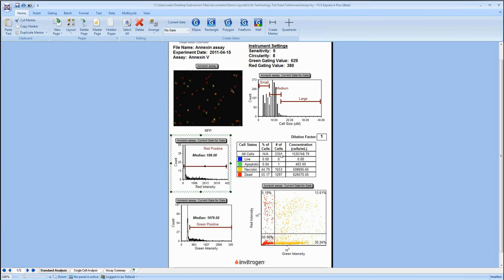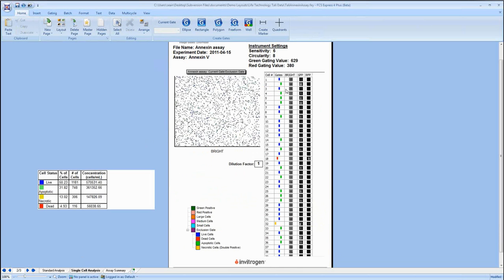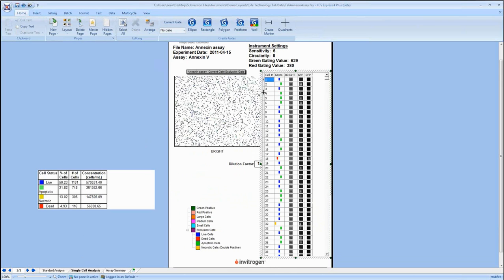And all of the statistics, including cell concentrations, are going to be updating with this. So it's a way that we can start analyzing this imaging data just like flow cytometry data. Again, each of the dots on this plot is not flow cytometry data. It's data that's coming directly from this image that was acquired on the Tali. And we can even take this down to a single cell analysis.